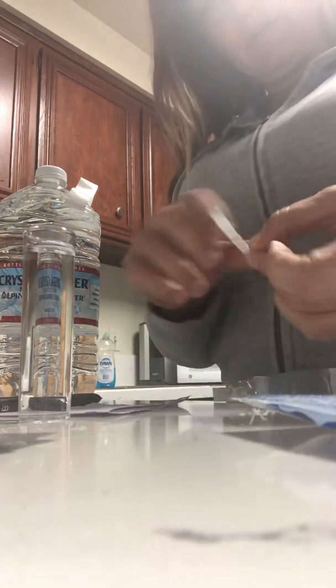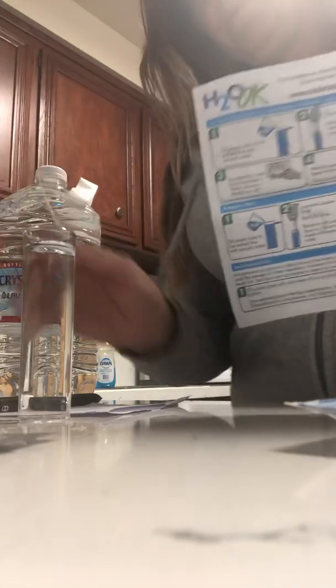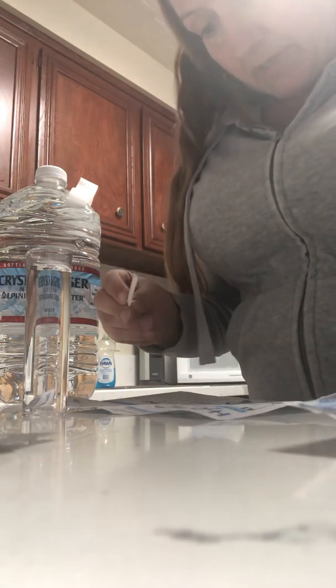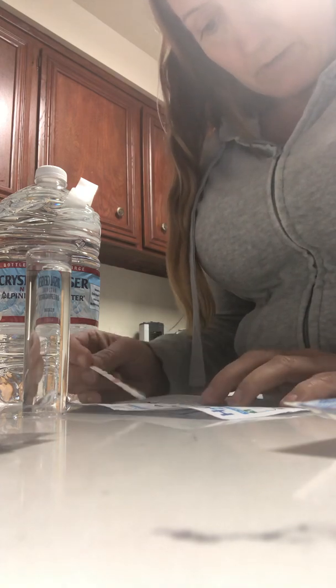Here's a test strip. I'm going to open it up. As you can see, all these little colors are on here. I'm going to get the instructions. The H2O OK instructions. For the first one it says to dip the strip in for two seconds, remove with pads face up, shake once to remove excess water, and immediately read the hardness.